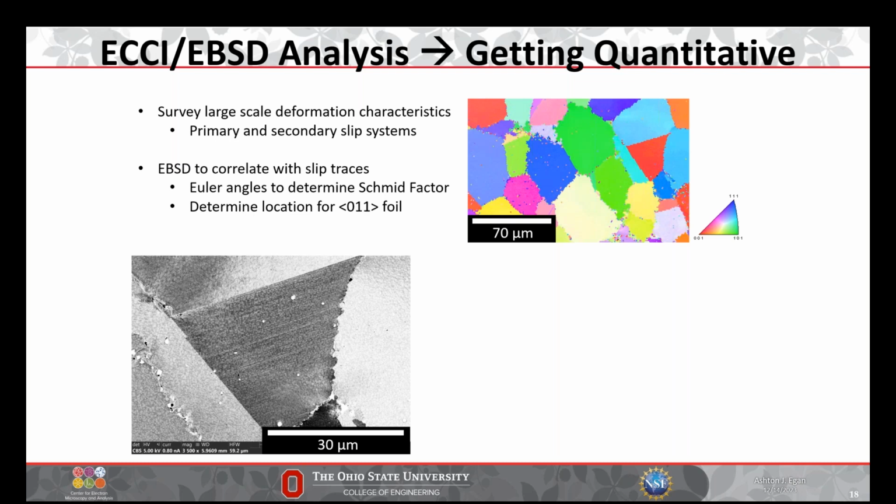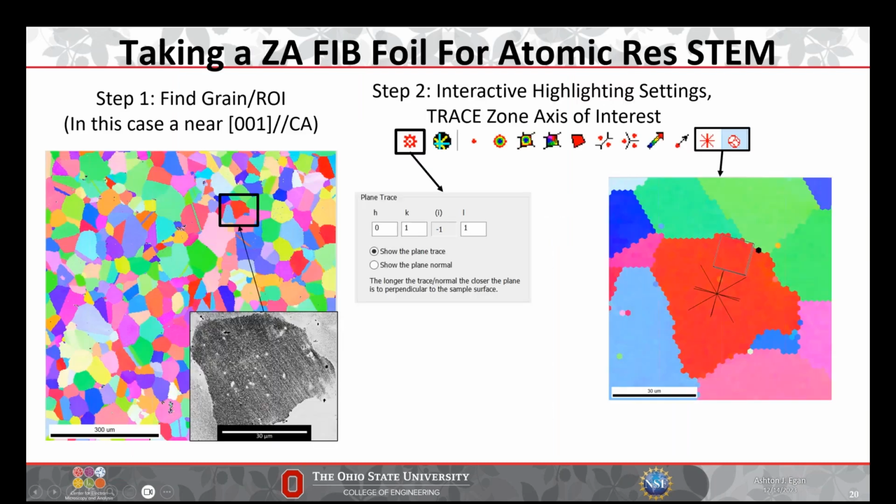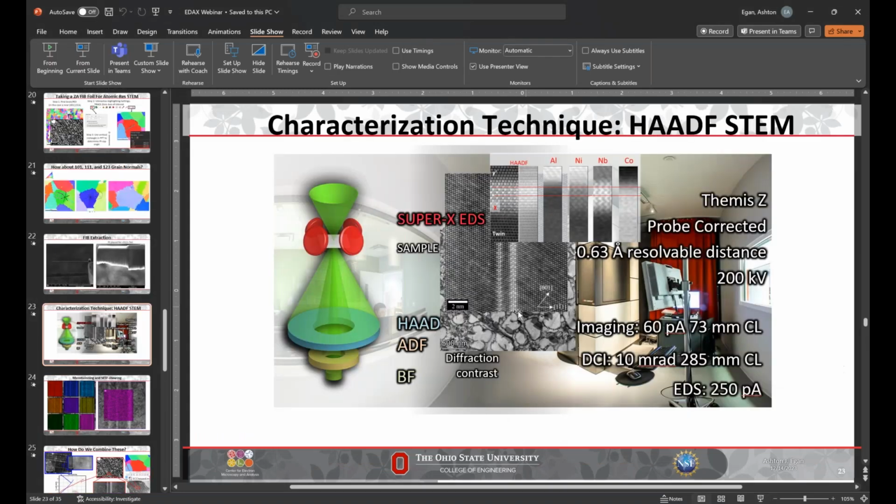Okay. Is it possible to quantify the dislocation density from ECCI analysis? The dislocation density, I'm sure it is, especially if you can see the density, but you also kind of know, at least for these defects, you can get an idea probably of how many dislocations have passed to give you this many traces, but you would have to make some assumptions there. I do know that they do geometrically necessary dislocation content analysis just from EBSD. But I would imagine there's ways in which to do this if you can see single dislocations, but I'm not an expert in that sort of thing. So.